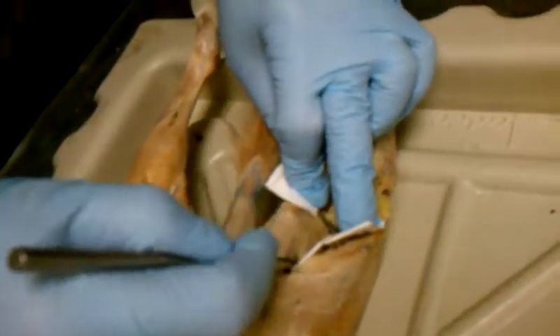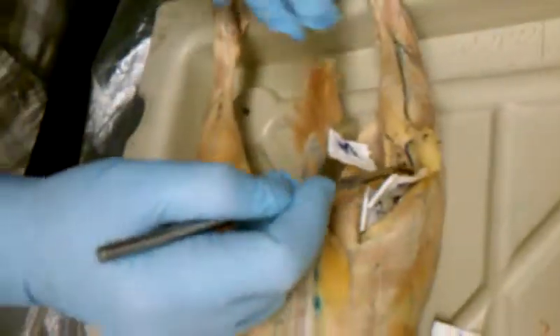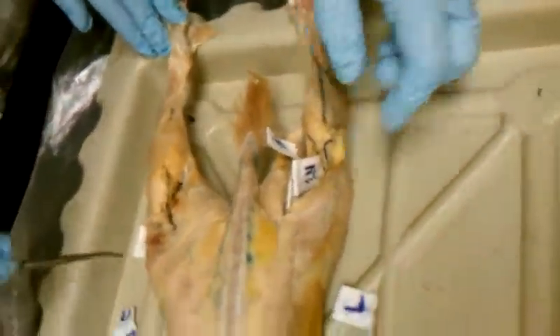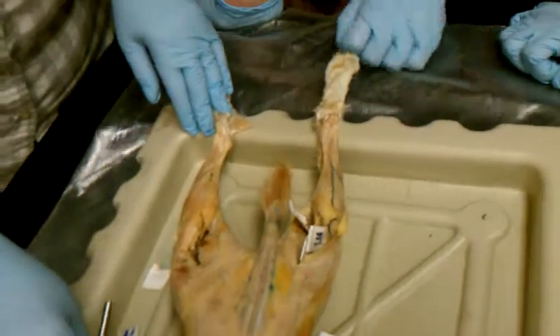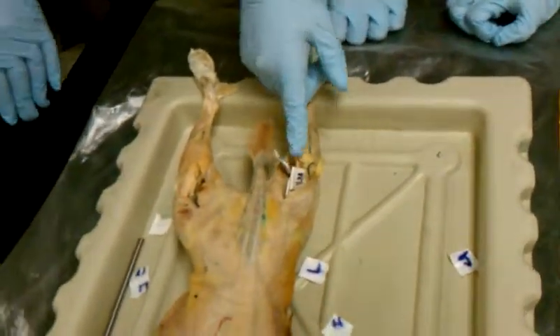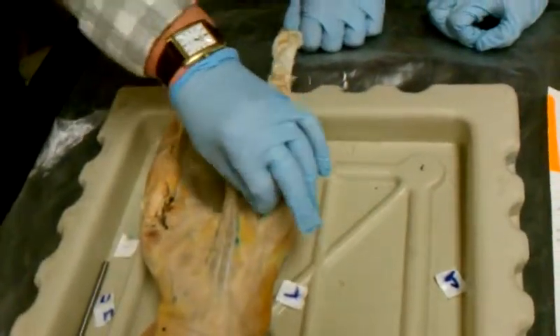So here's the popliteal vein and artery right here, right? And then here, this is the posterior, and here, this is the anterior. The anterior goes medial and then goes around the front. The posterior is lateral, anterior is medial, and yes, it loops around the front. Okay. Anterior tibial artery, posterior tibial, popliteal.